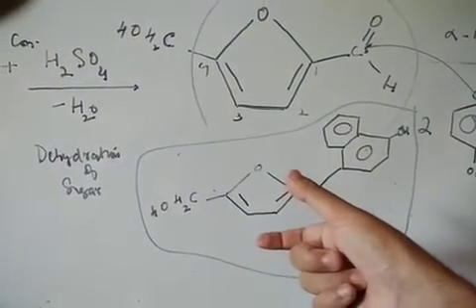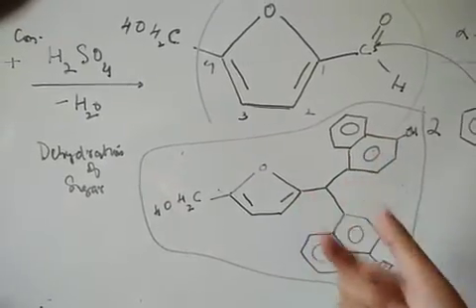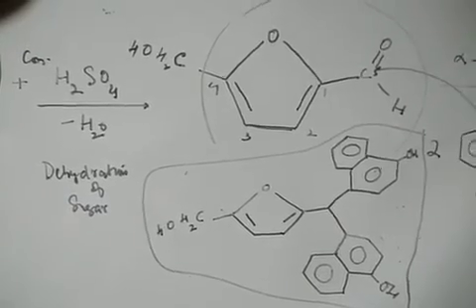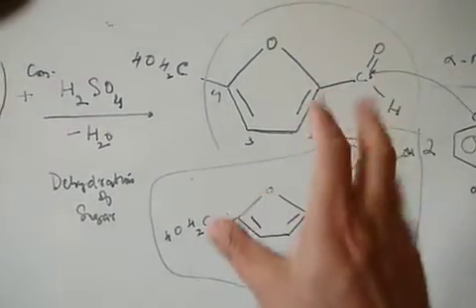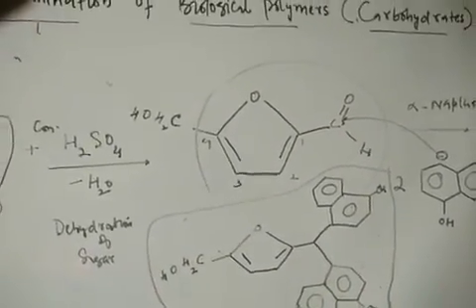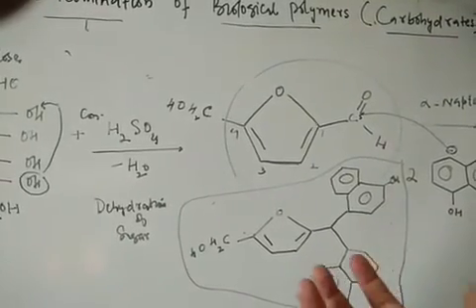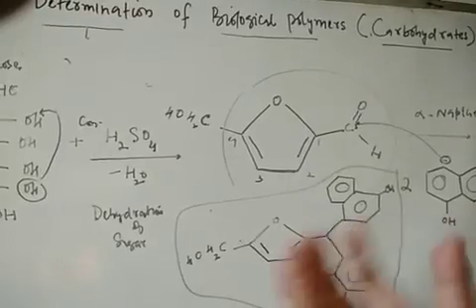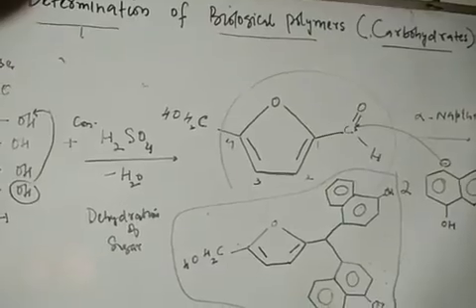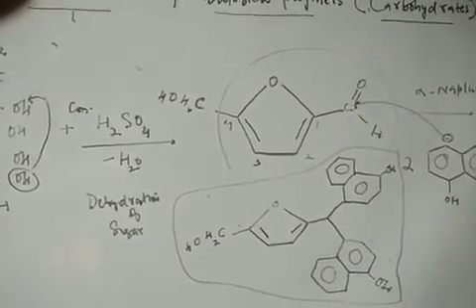So at that junction, this molecule gives this purple color. The presence of this purple color which comes out in the test tube indicates that your sample contains a biological polymer. So this is our reaction theory and the basics involved. Now in the next lecture we'll show the video where we'll prepare this in the lab, and we'll see the ring formed at the junction of these 2 layers. That indicates the formation of this complex. We will see that in a separate lecture. So this is all in the theory and description.